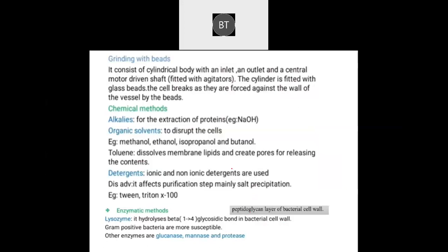So these chemicals are mainly used to rupture particularly the mammalian cells. For disrupting the bacterial cells, detergents have to be used in conjunction with the lysozyme. And with the fungal cells, for example, if you're using yeast and mold, the cell walls have to be similarly weakened before detergents can act. So you use the detergent, and sometimes you have to use the lysozyme to break the components.